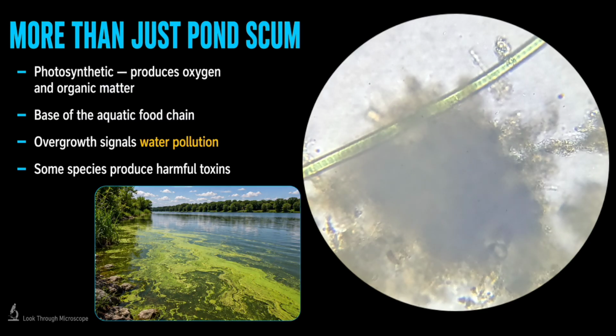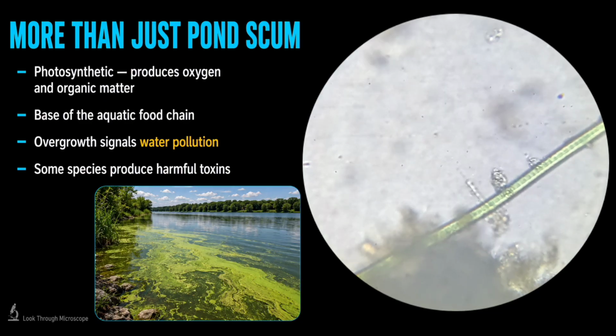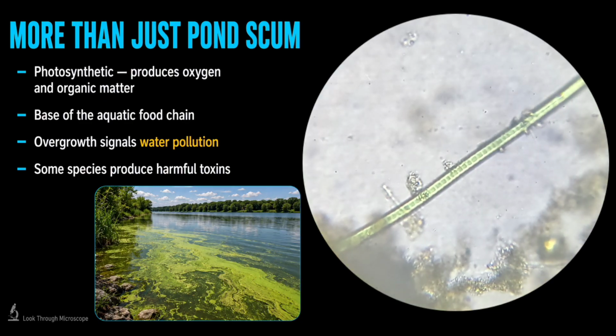Even if this looked familiar to some of you, it should. This is one of those organisms many of us glanced at once in a school textbook and forgot. Now you're seeing it alive, moving, doing exactly what the books described.